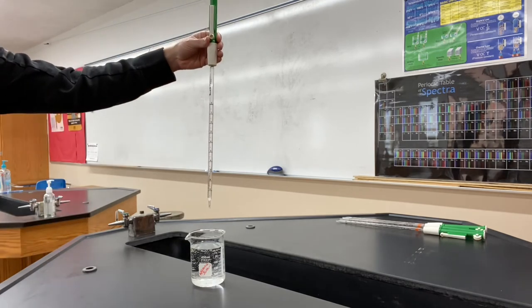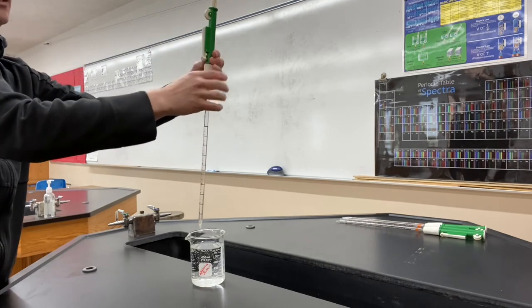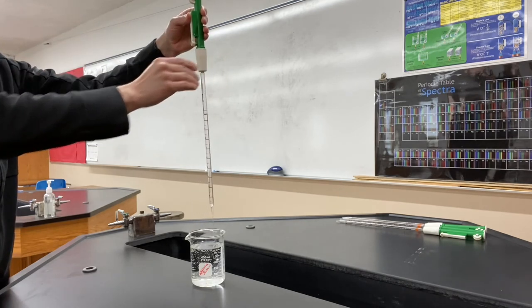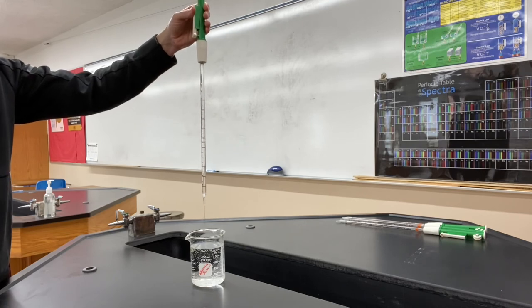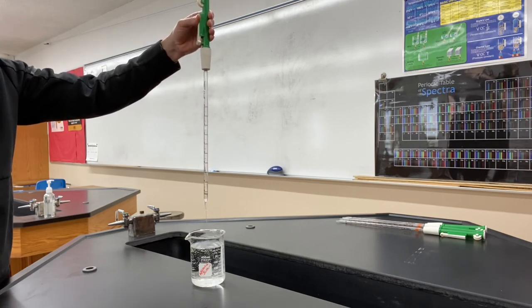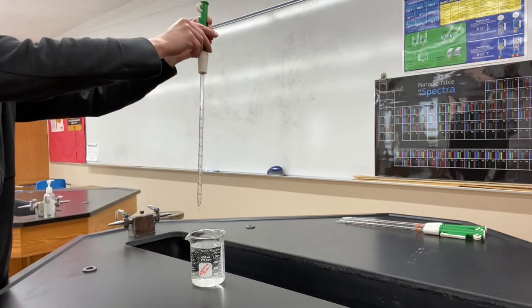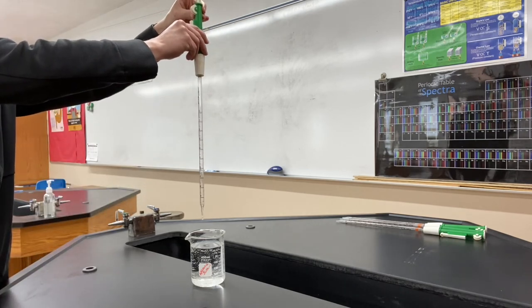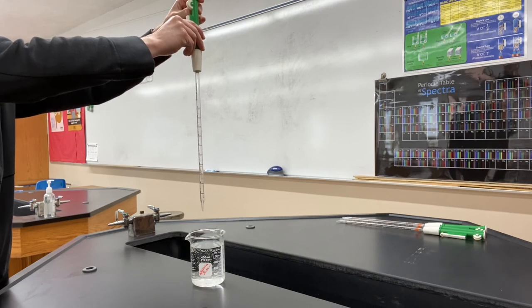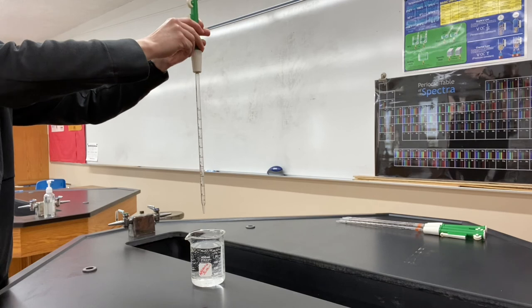Once you have it to your desired measurement, this on the side is just a release valve. And if I push that release valve, the liquid will flow out of the bottom. And it should deliver the amount that you've measured, okay? There's gonna be a little bit left in the bottom. To get that last bit out, you just push the plunger down until it blows out that little bit at the bottom. So these take a little bit of practice to work with.